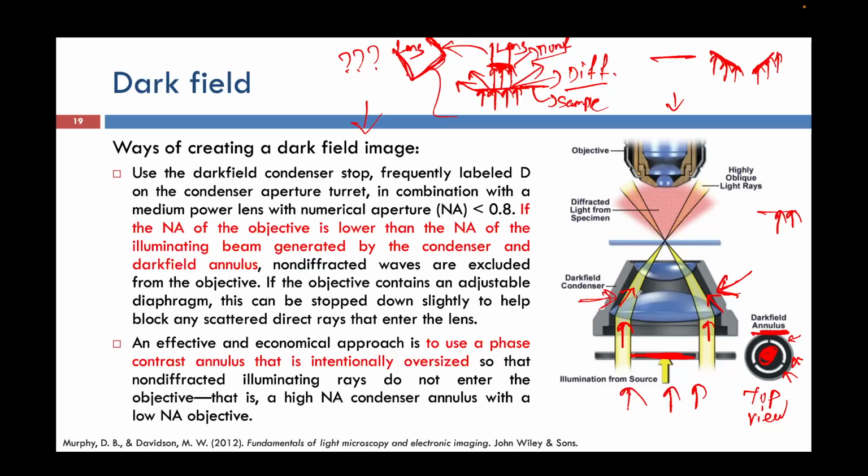That is the dark field condenser, and this setup is known as the dark field condenser setup. Instead of hitting the sample like this, I am hitting the sample at an inclined angle. My initial incident beams go like this, but with the dark field condenser I changed the direction of my incident beam.